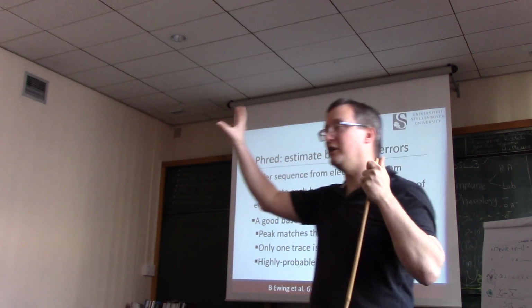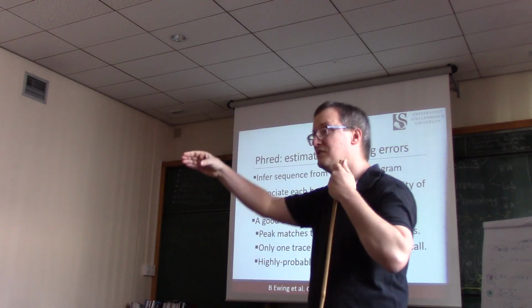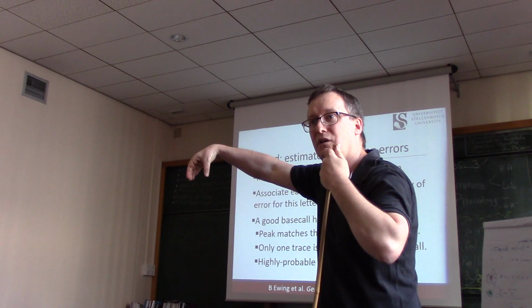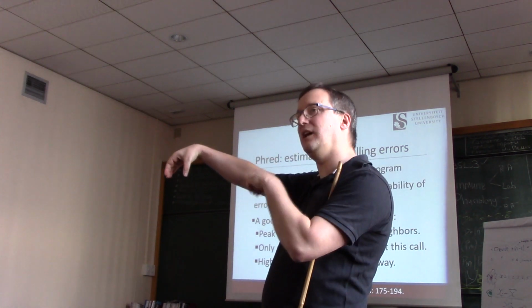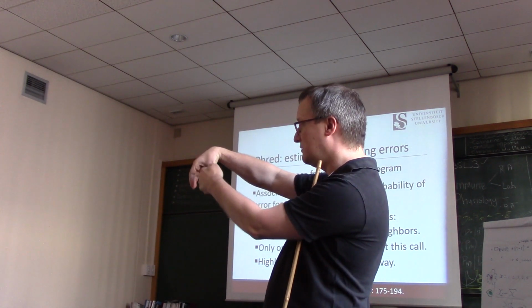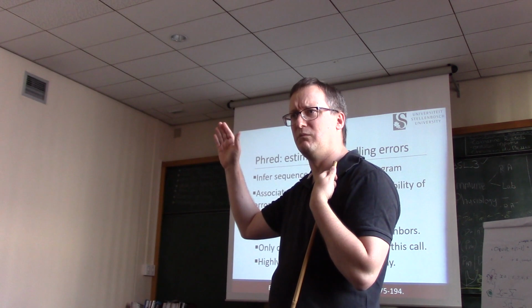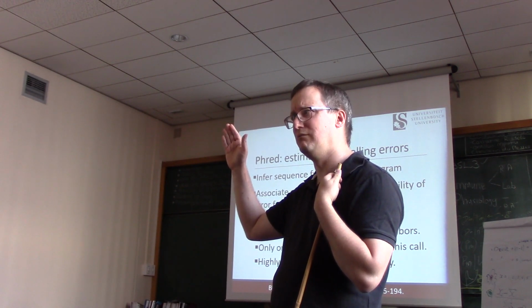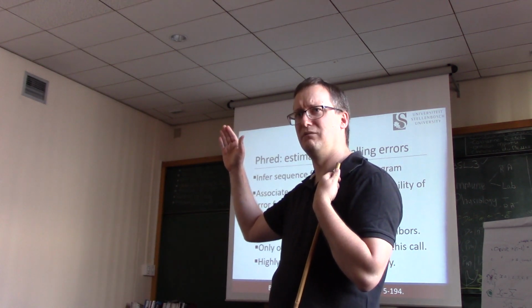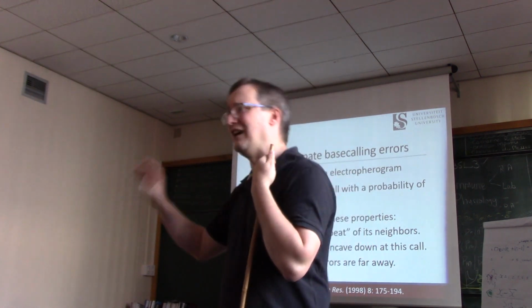So we're going to ask about the concavity of the signal, and it needs to be concave down. So I want you to point downward. So at this point, we're saying if we're going to call this a base call, we want the signal to be concave down. Now, do we have math people in the room? We have a few math people in the room. I was on math team in high school. I love this stuff.